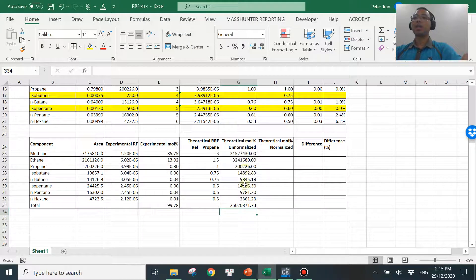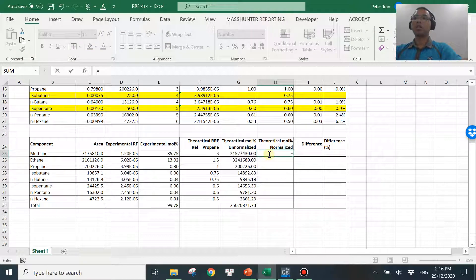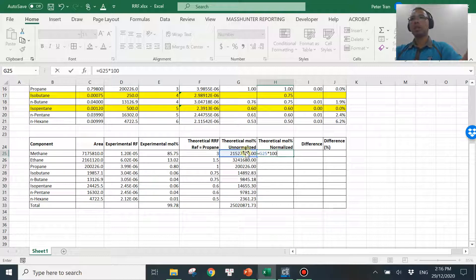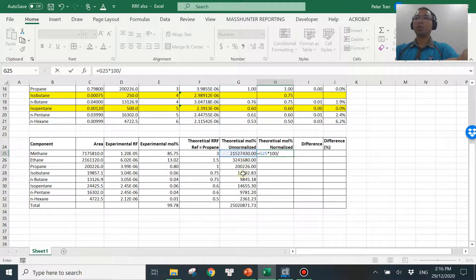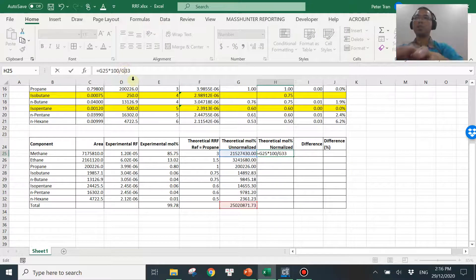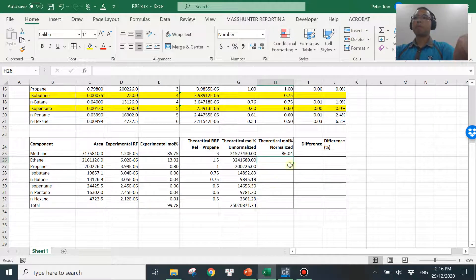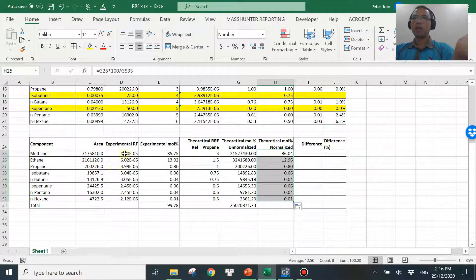Because we know everything should normalize back to 100%, I can normalize all of this. I take each value, multiply by 100 — or whatever total percentage you expect — and divide by the sum of all eight compounds. I lock row 33 and drag the formula down. So this is the way to get the normalized values. You can see that I don't even use the experimental RF here — I still come up with these normalized values using only the theoretical RF.